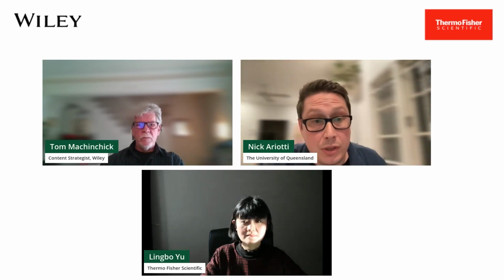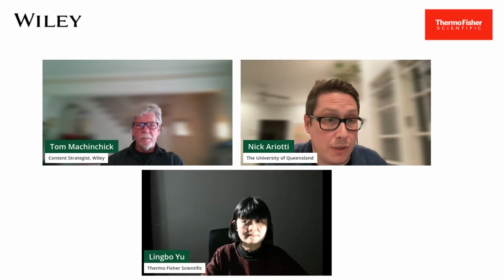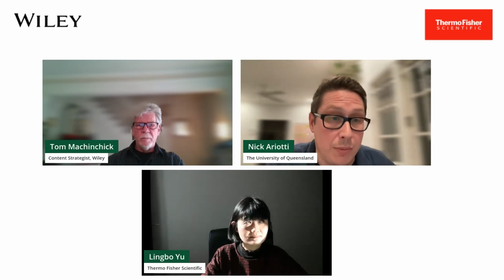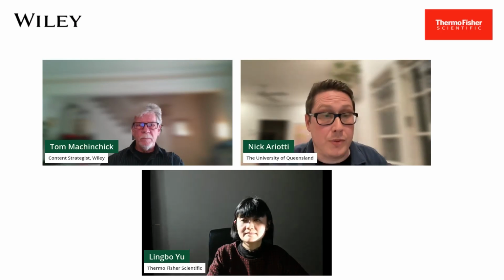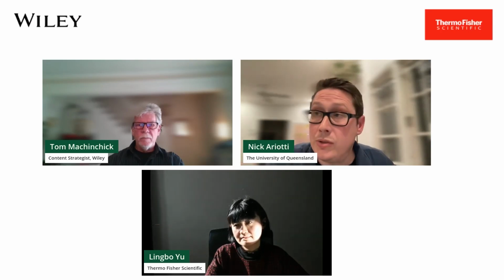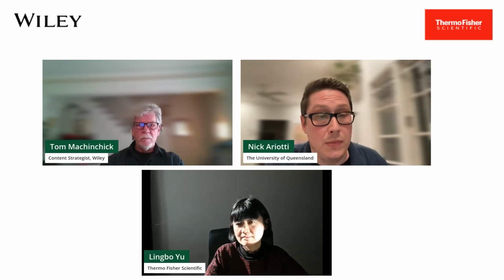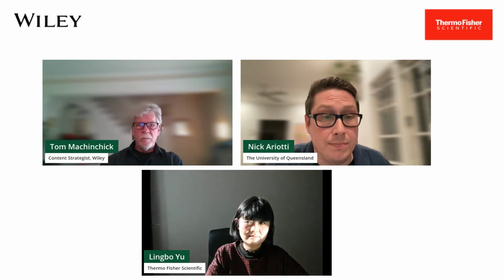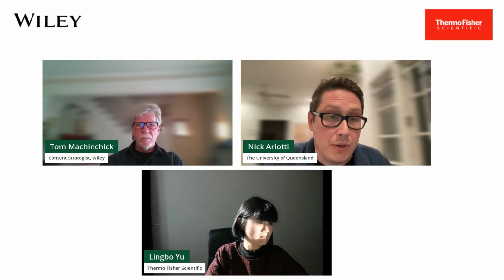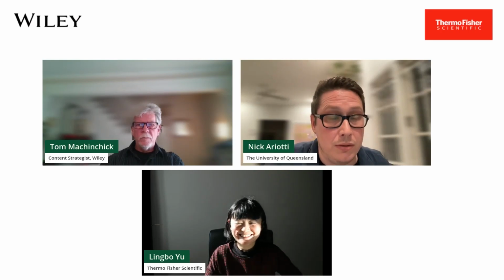We do this all in RELION simply because something like Dynamo just doesn't have Bayesian polishing or 3D CTF refinement, so we can't really get to high resolution using that sort of software. And RELION has some really nice tutorials available online, so you can teach yourself how to do these things. The tutorials are based around viral particles, but with a little bit of troubleshooting and practice and hard work and dedication, you can get it working.